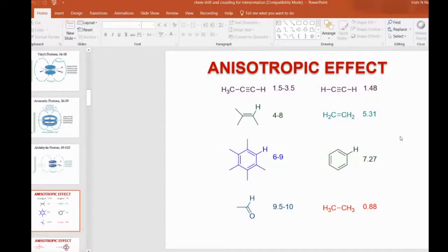One Gogol is asking, sir, while identifying isolated compounds from natural products, what's your suggestion for elucidating the structure, steps like that? For structure elucidation of natural products, NMR may not be enough. NMR is still the most powerful technique to elucidate the structure. We may need additional information from mass, for example, the molecular mass of the compound, and some information can be gathered from IR, what functional groups are present. So composite data would be helpful when we try to analyze unknown compounds, especially complex natural products.